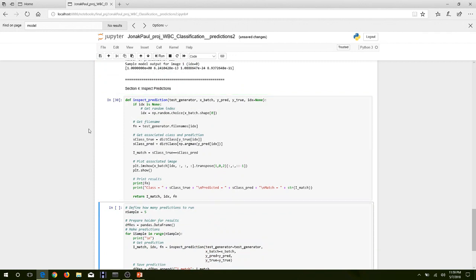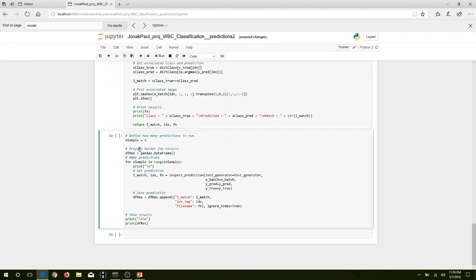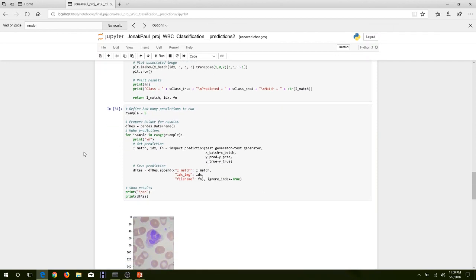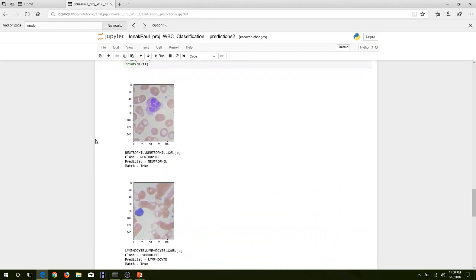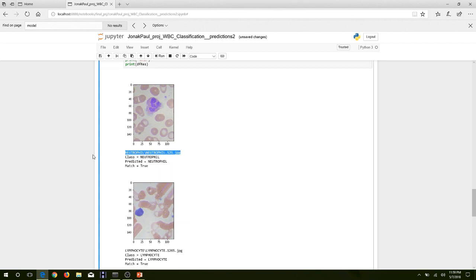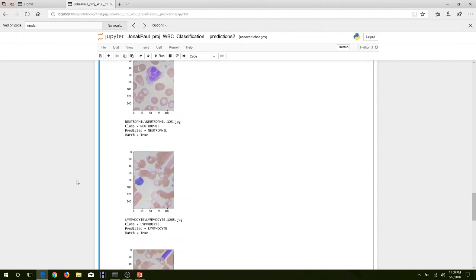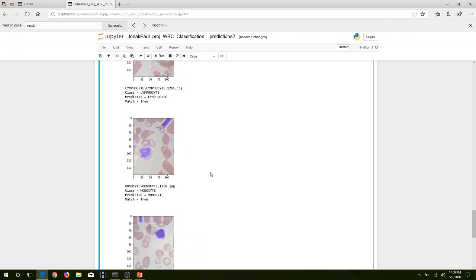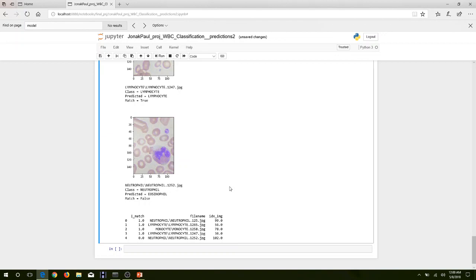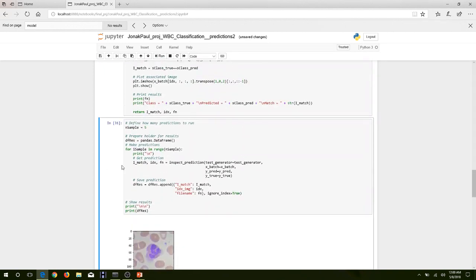We want to visualize this, so we make a quick function and run it on five random samples. The function presents the image along with the file path to confirm the true class, and then shows our prediction. For example, the true class is neutrophil and the prediction is neutrophil — a match. Next: lymphocyte predicted as lymphocyte, monocyte as monocyte, lymphocyte as lymphocyte, and neutrophil predicted as eosinophil — that one was wrong, which makes sense given we had 93% accuracy, not 100%.